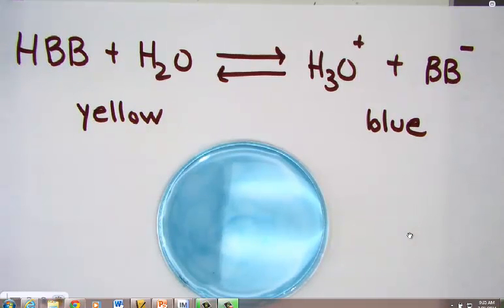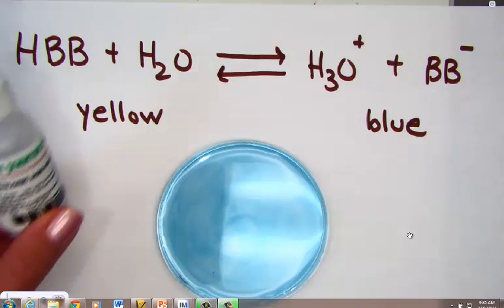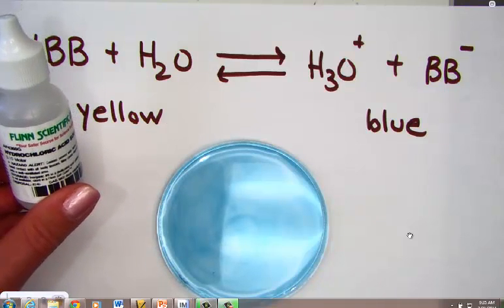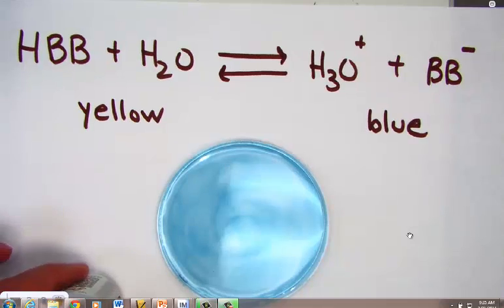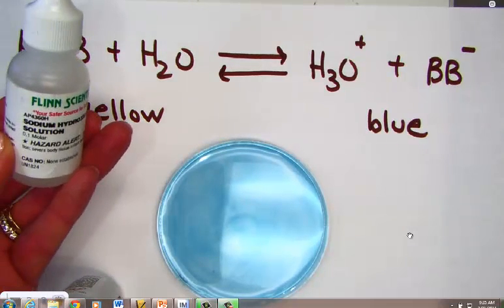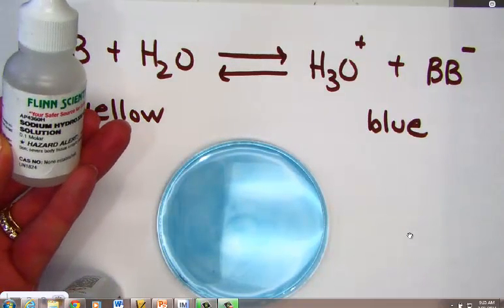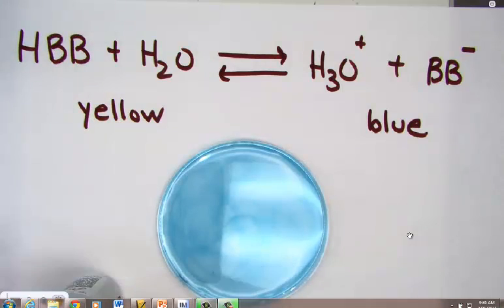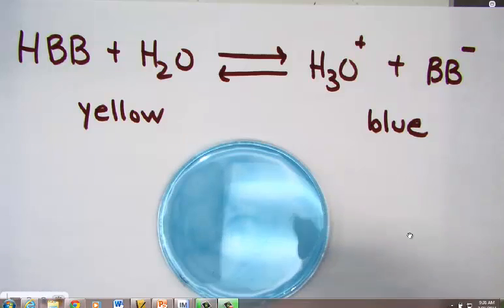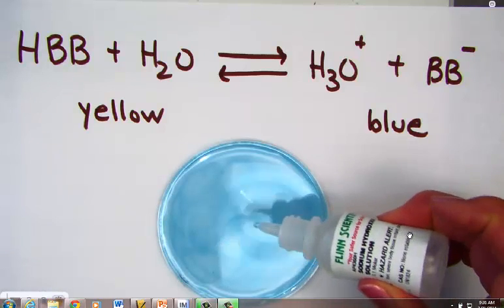Now, the stress that we will be applying — the disturbance to this equilibrium — will be the addition of hydrochloric acid, or the addition of sodium hydroxide, NaOH. Let's begin disturbing this system that's in equilibrium by the addition of sodium hydroxide.